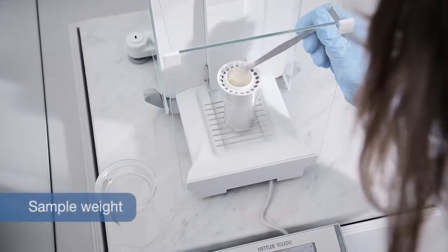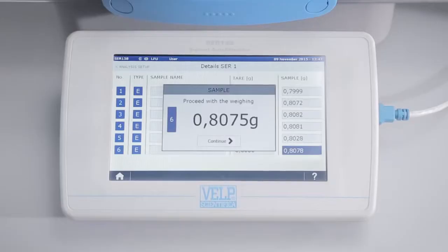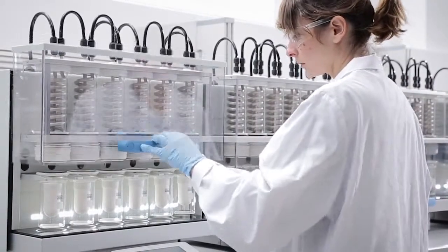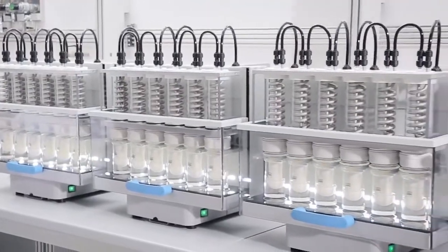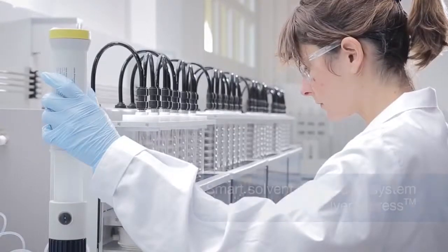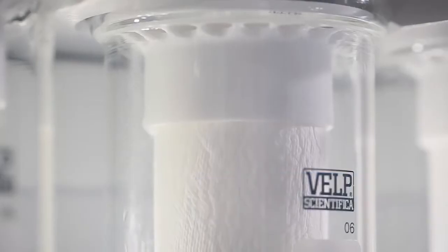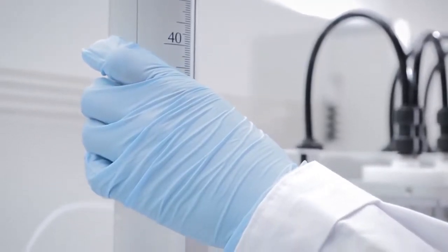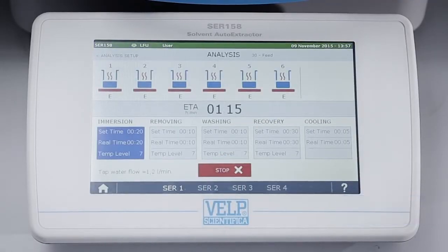Weigh the homogenised sample directly in the VELP extraction thimbles and select the positions required. Position the extraction thimbles, select the method and add the solvent. The automatic VELP solvent dispensing system, Solvent Express, minimises exposure to the solvent, ensuring operator safety. Then simply press start to begin the extraction process.